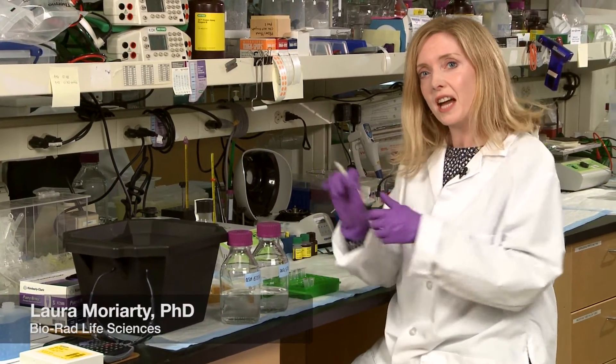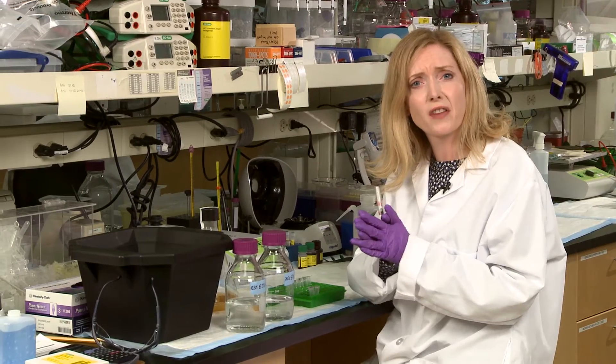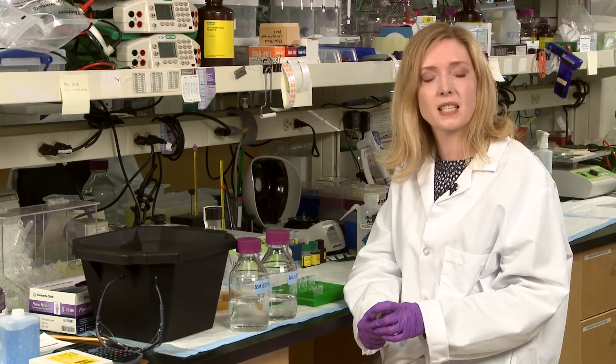Oh hi! If you're like me, there's nothing more frustrating than running your gel at the end of a long day to find that your protein is degraded. Well, here are four simple things you can do to minimize that pesky protease activity.